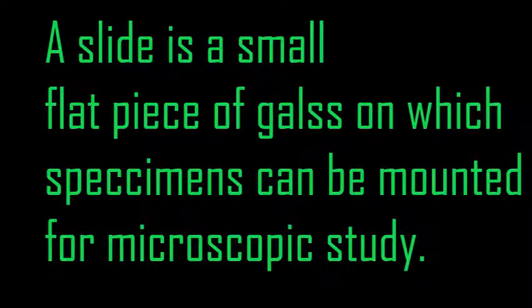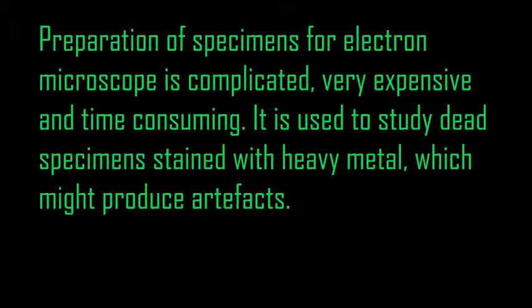General preparation of specimens for the electron microscope is complicated, very expensive, and time consuming. Preparation deals with dead specimens stained with heavy metals.